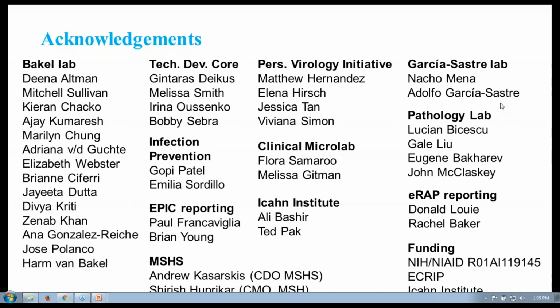There's CheckM, and then in HGAP, you're going to get a stat that looks at the percentage of reads that are mapping back to the assembly, and if that mapping percentage is fairly low, I would be concerned about the completeness of the assembly. Generally, you'd want to see that around 95% or even above, I think. But I'm not a bioinformatics person. It's not my main focus, so tough question, but something to think about.